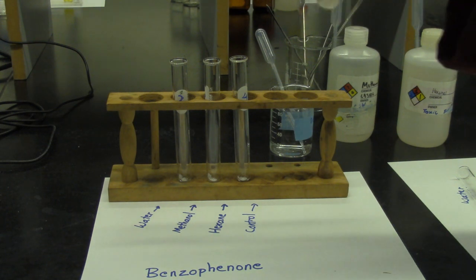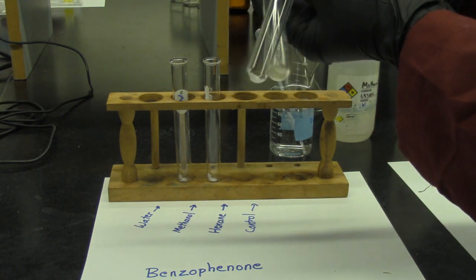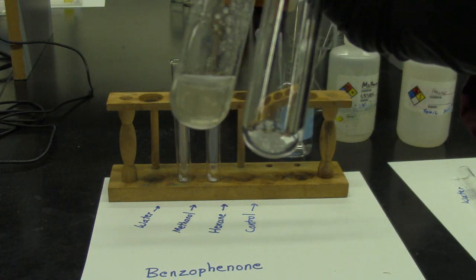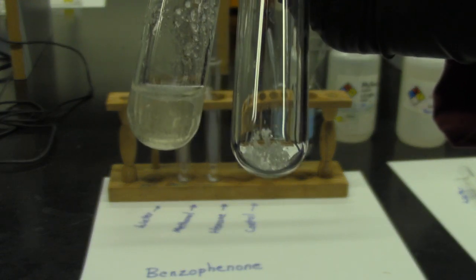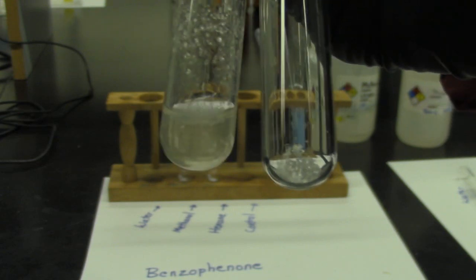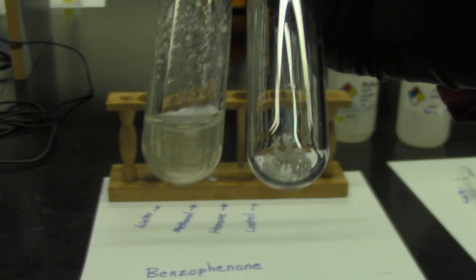After 60 seconds of stirring, you will compare the first test tube with the 4th test tube, which is the control, and write down the observation: soluble, insoluble, or partially soluble. To be partially soluble, it has to dissolve at least 50% of the amount.